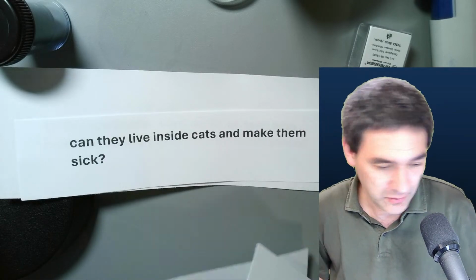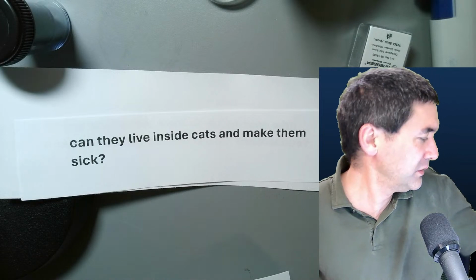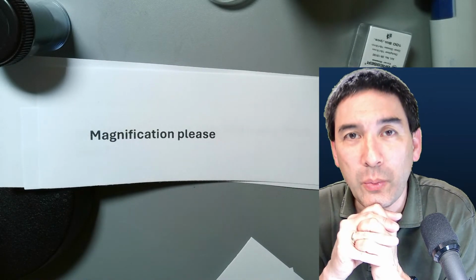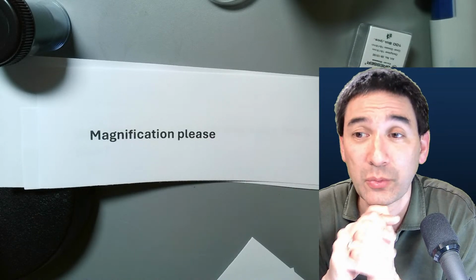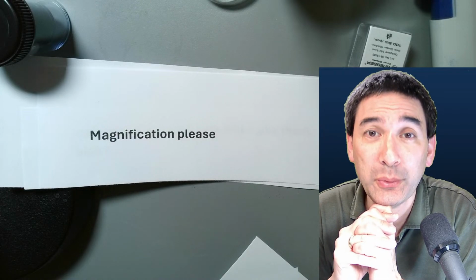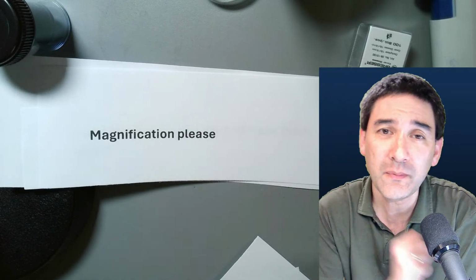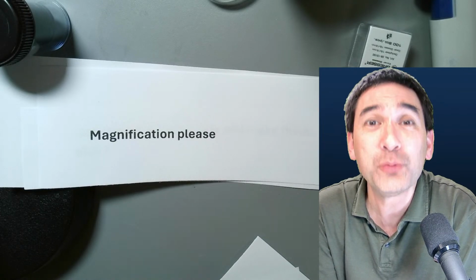Okay, here's another question over here. Magnification, and this was essentially a request beneath one of my videos, and I already talked about this because a similar question appeared. What is the magnification? You might have noticed that I do not put any magnification into the corner, for example, and I also do not put a scale bar. And the question is why not? The reason is, which magnification should I put on here?